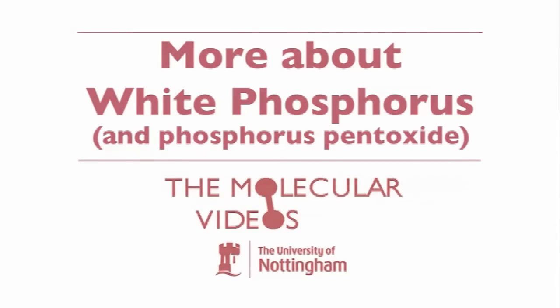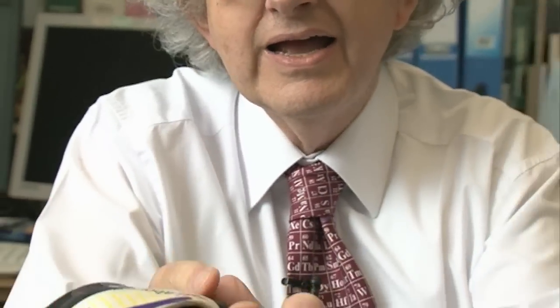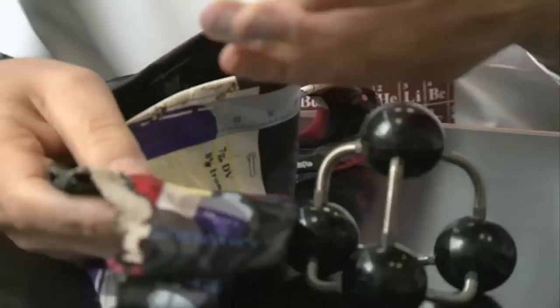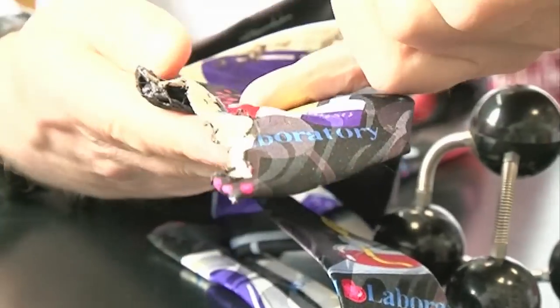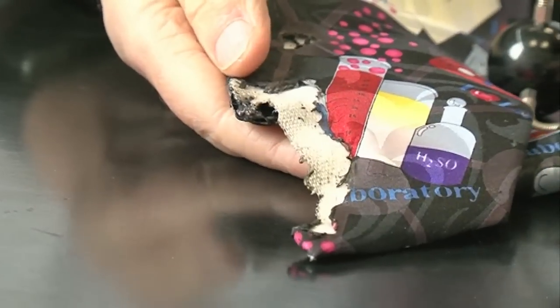One of my colleagues was wearing a tie — you can see a rather nice tie. And he got a bit carried away during a demonstration and spilt a solution of white phosphorus on the end of his tie. And before the end of the lecture, the solvent had evaporated and his tie caught fire. You can see a whole chunk of it has got burnt off.